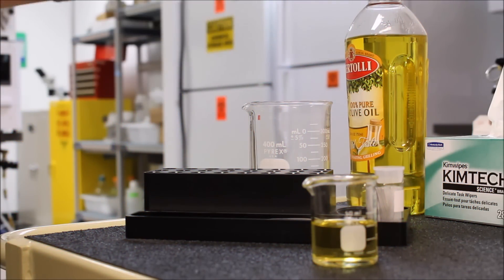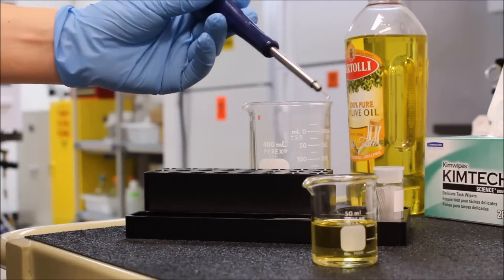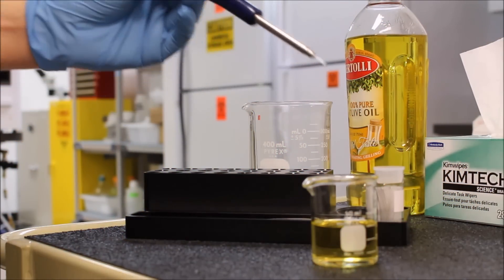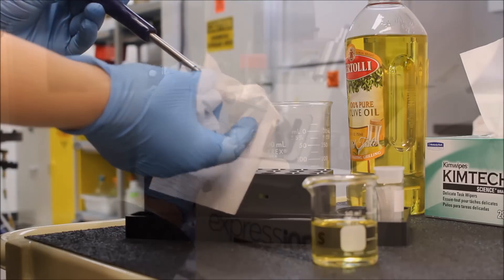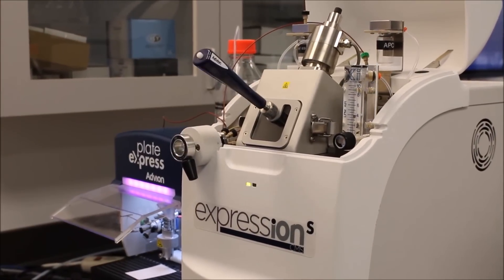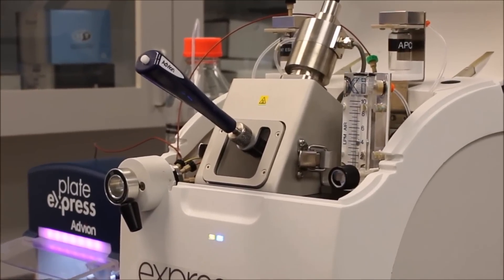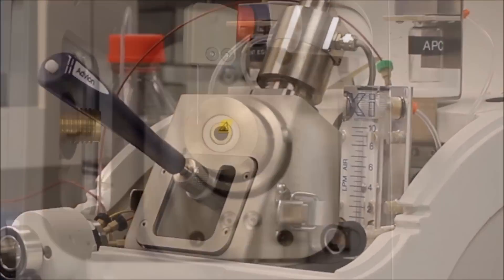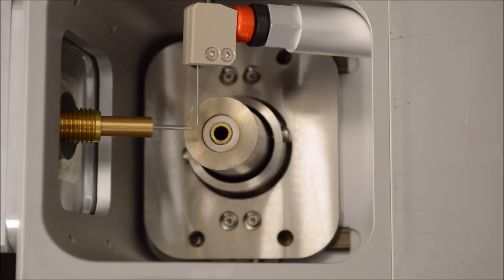Chemists simply dip the closed end of the glass capillary into the sample of interest or scrape the surface of the solid and then place the capillary into the mass spectrometer. Heated nitrogen in the ASAP-enabled APCI ion source will vaporize your sample, whereas the corona discharge needle will ionize it.